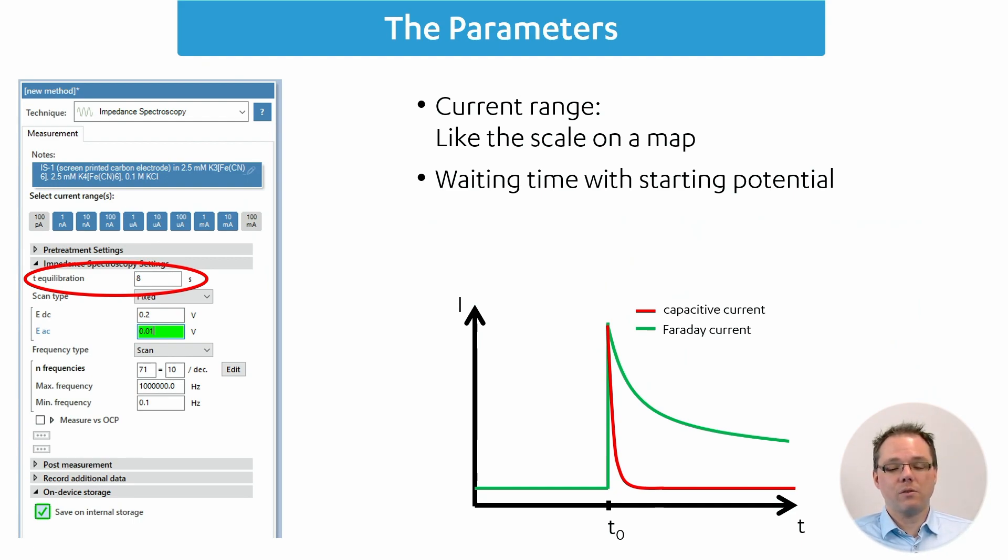The next point is your equilibration time. This has two purposes. One is that you apply your starting potential, and in case that starting potential is different than the OCP of the electrode, you give the system some time for a capacitive charging current to decay. But it also gives the potentiostat time to choose the right current range.